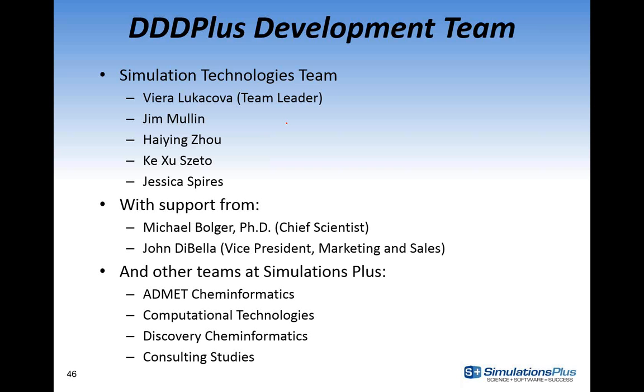If we're talking about dermal, that kind of thing, we don't have that available within GastroPlus. We are developing certain other non-oral formulations, controlled release microspheres for long-acting injectables, that kind of thing. And we're interested in what you guys have to say and what you guys want in the software.